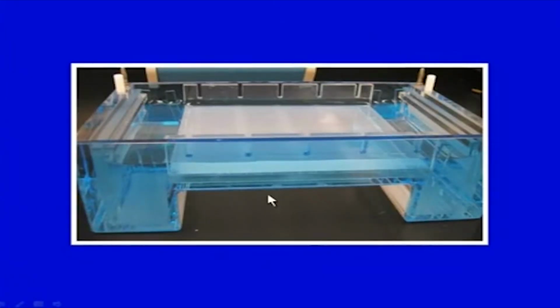This is a typical horizontal gel electrophoresis apparatus for running the agarose gels. As you can see, there is a tank where buffer is put, and there will be 2 electrodes, one positive and one negative. The agarose gel is placed in here, and then a sample will be loaded. We have discussed earlier that wells are created and sample is loaded, and the DNA will run towards the positive electrode.